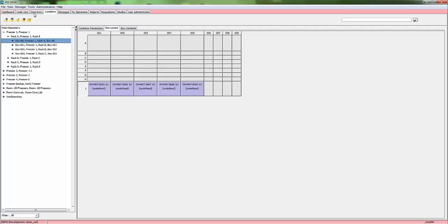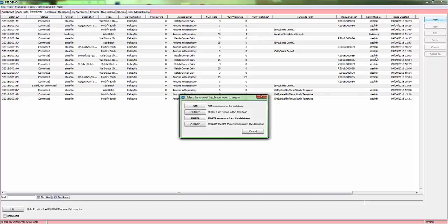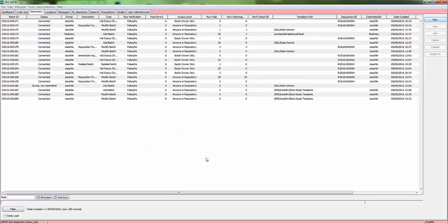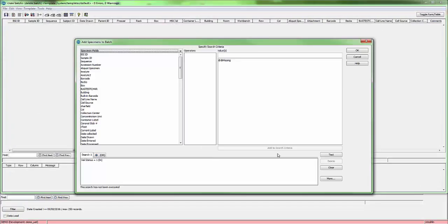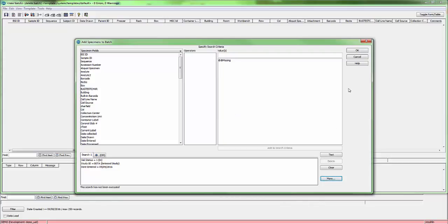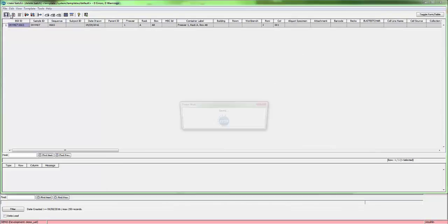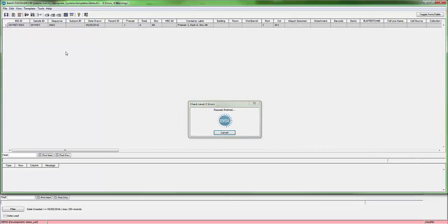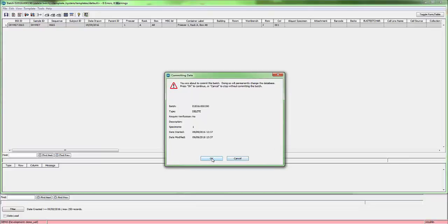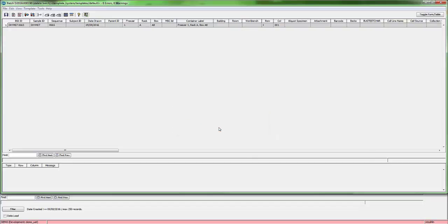In the BSI client, let's look at specimen deletions. The study is already set to require an e-signature for this type of change, so on the Data Entry Manager, select New, then Delete. Search for specimens in the Betazoid study and add them to the batch. Confirm that these specimens should be deleted from the system. Save and attempt to commit the batch. Enter the reason for e-signature and correct credentials. The batch is processed normally.